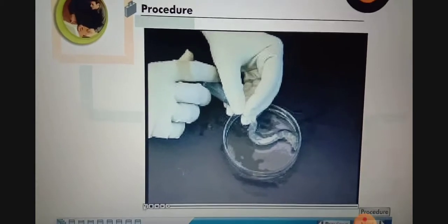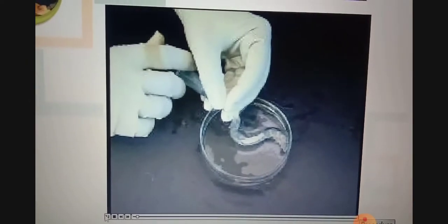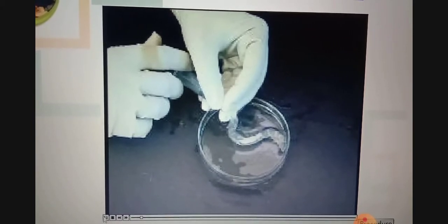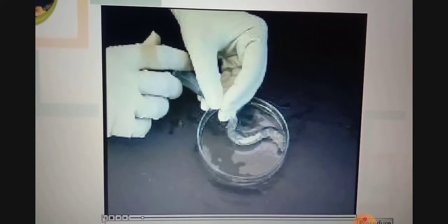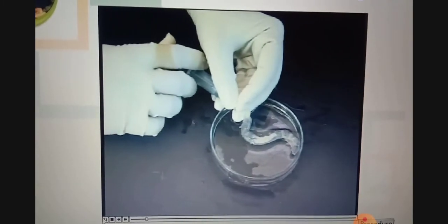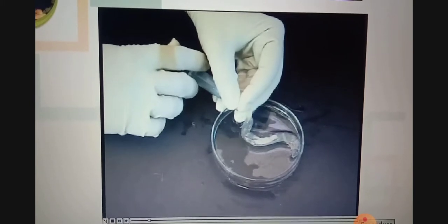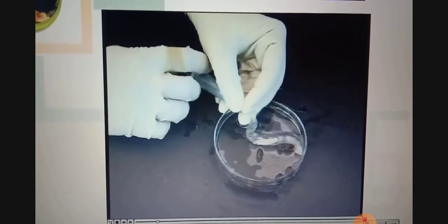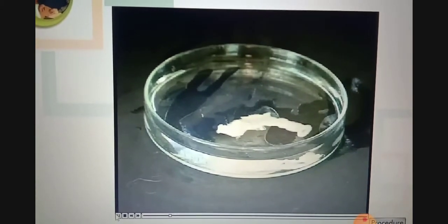To study the effect of spasmogens and relaxants on rabbit intestine, isolate the jejunum of the small intestine. Clean the contents of the jejunum with Tyrode solution in a syringe. Avoid any damage to the smooth muscle lining of the jejunum. Take a piece of jejunum about 2 to 3 centimeters long. Ensure the lumen of the jejunum is clean and open.